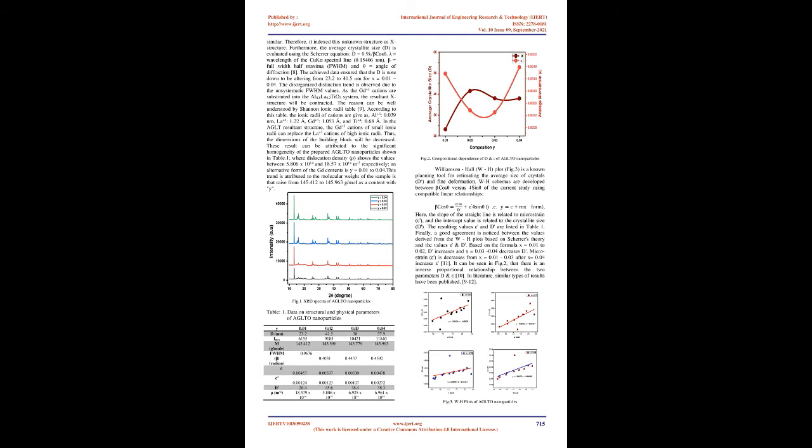6,155 to 11,840 with increase of Gd content in the Al0.8La0.2TiO3 system. Therefore, it is confirmed that the substitution of Gd element induced the crystallinity of Al0.8La0.2TiO3. However, it is noticed that these peak positions are not matched with any standard structure.